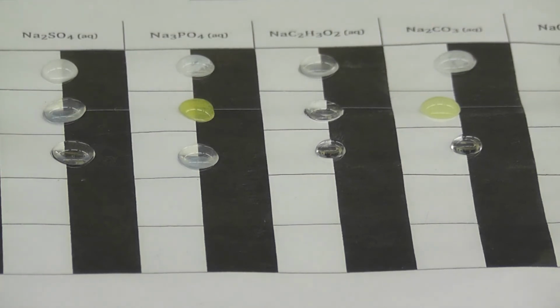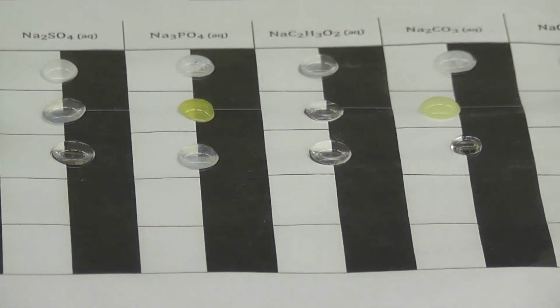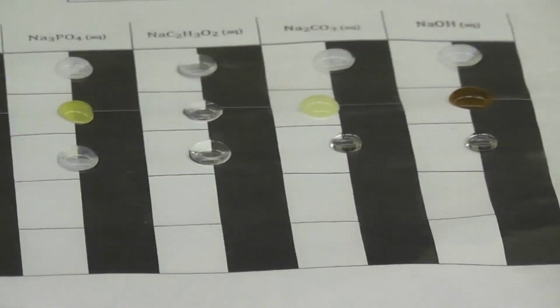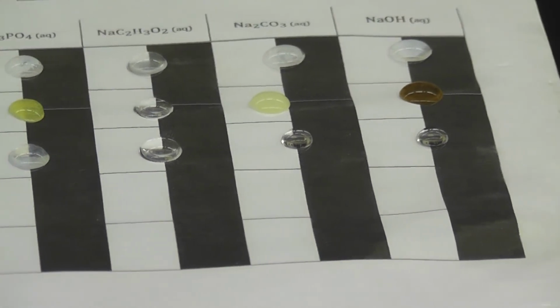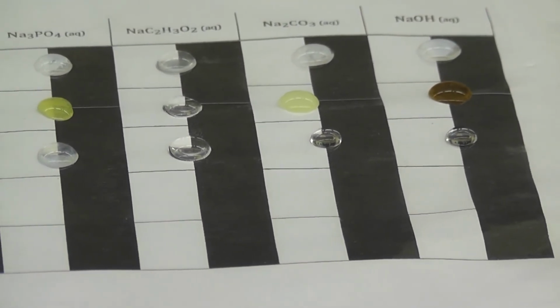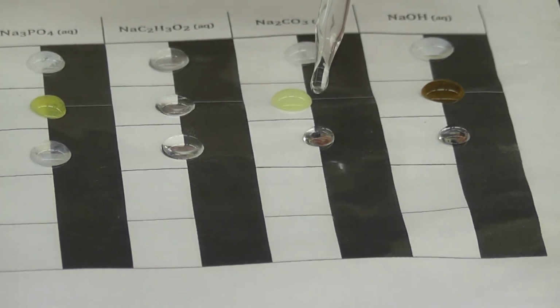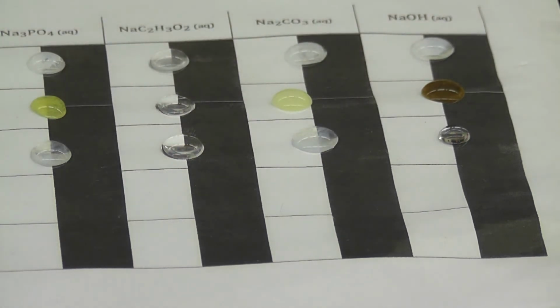Okay, now we're doing the calcium chloride with the sodium acetate. So add 1 drop of sodium acetate to the calcium chloride. There we go. Okay. Now the calcium chloride, we're going to add the sodium carbonate. Add 1 drop of sodium carbonate to the calcium chloride. Ooh, there we go, we have a little something.